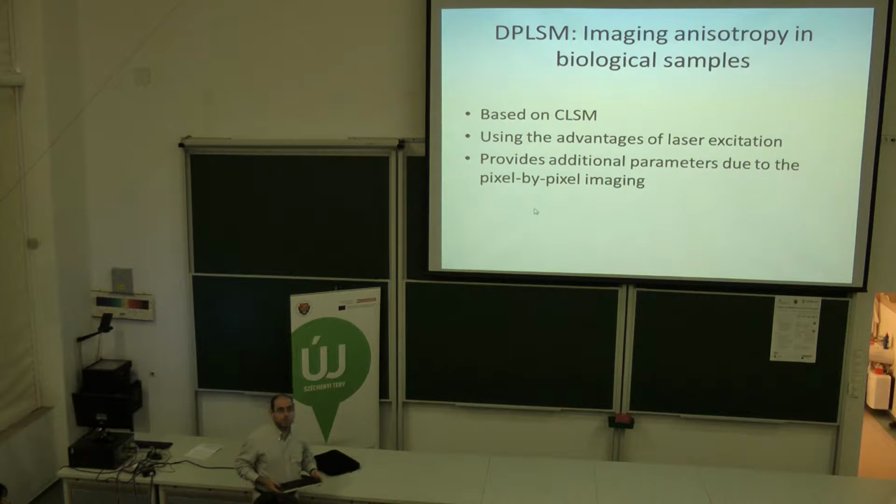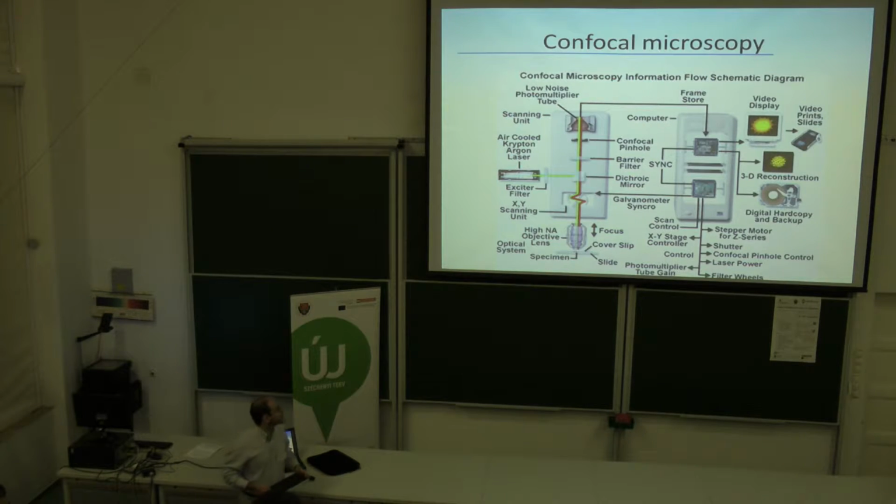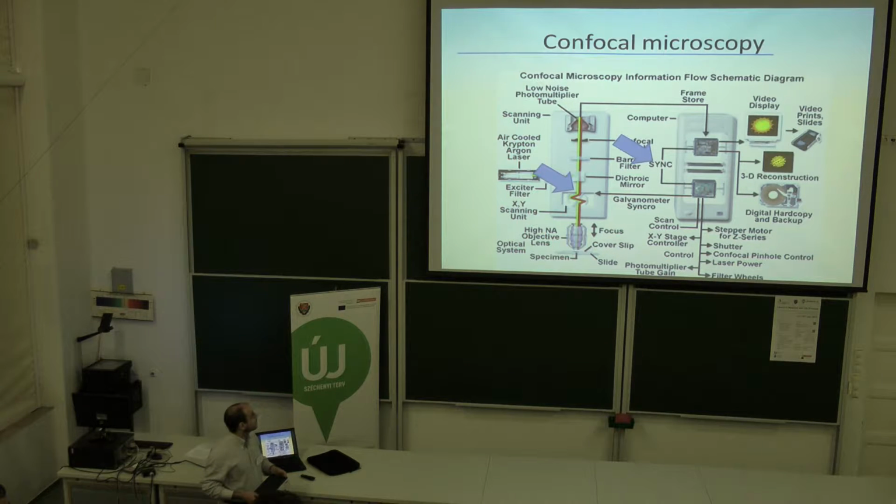Gábor's talk is based on confocal lasers and microscopy, using the advantages of laser excitation and the imaging process of a confocal microscope, which builds the image pixel by pixel by scanning. I don't want to speak about the theory of LSMs, we heard that this morning, but I would like to emphasize this point-by-point data collection by the scanning mirror and the synchronized data acquisition.